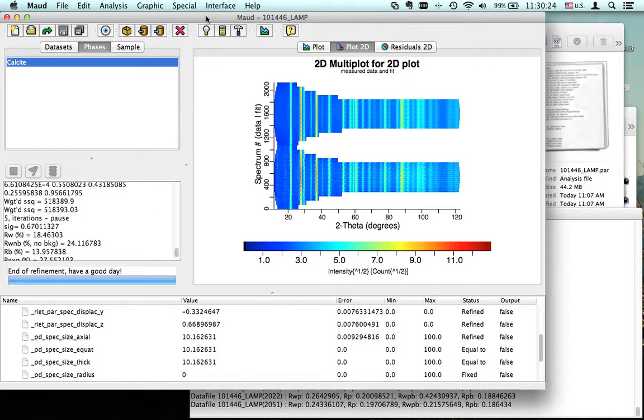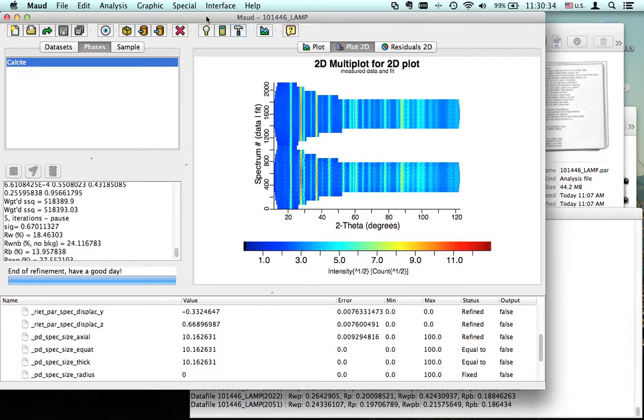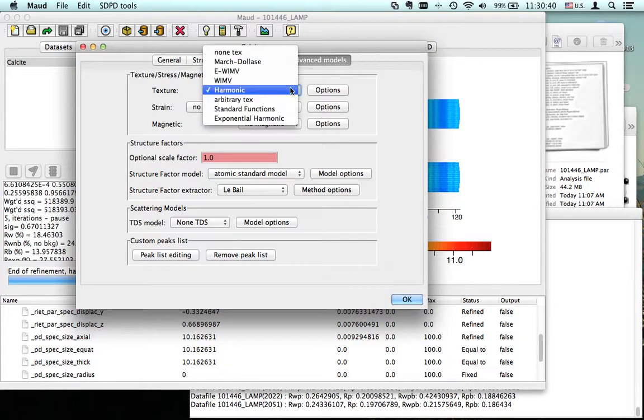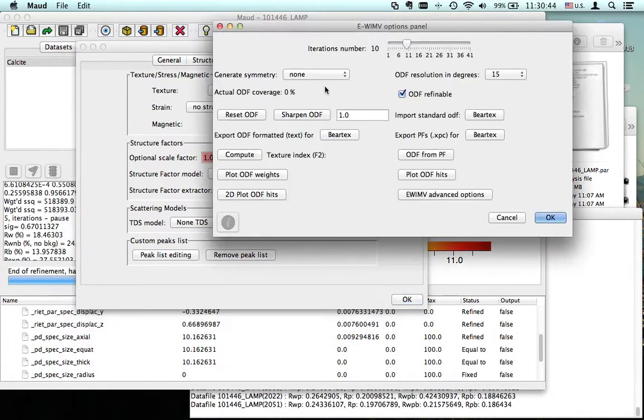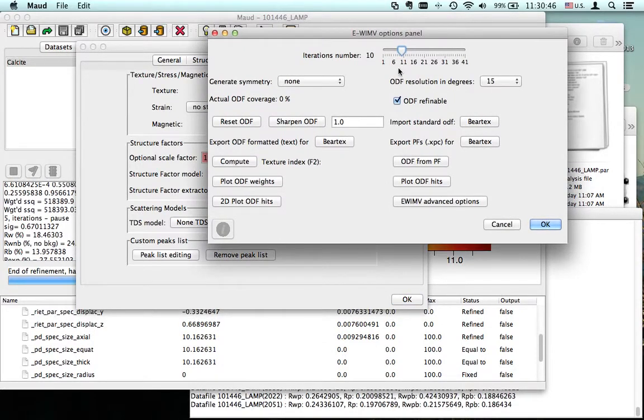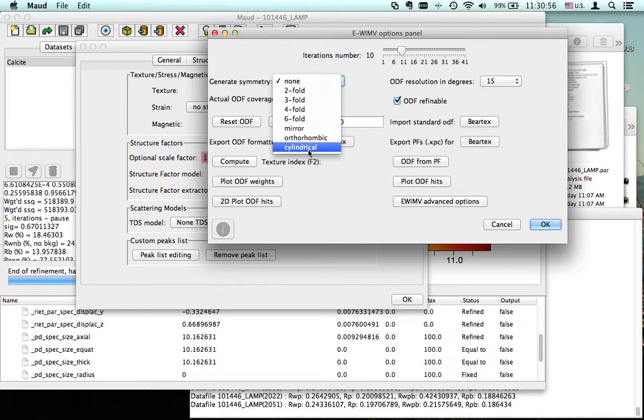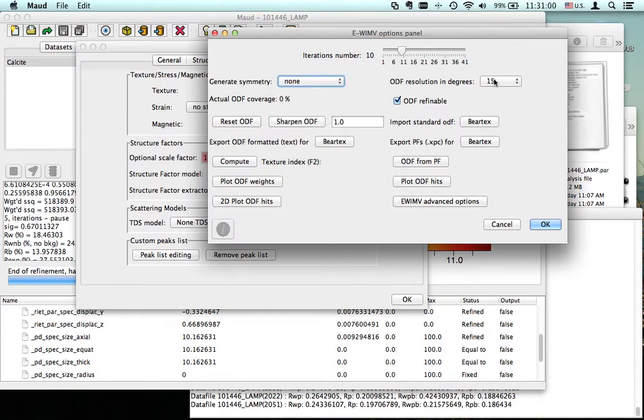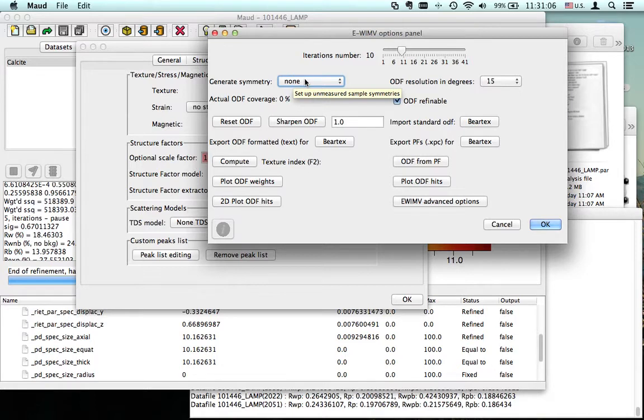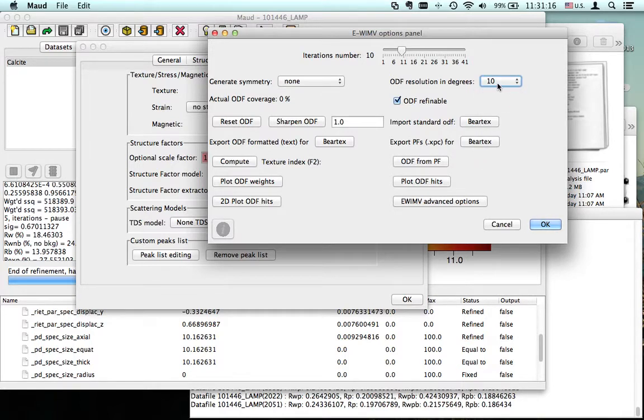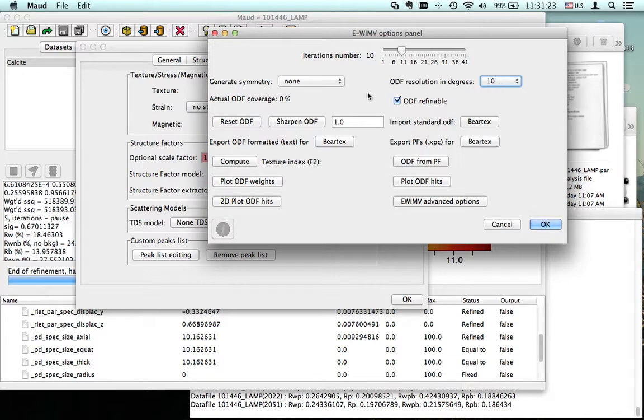Now let's see how we can do a texture analysis using EWIMV instead. We only need to change here in the sample—we change the texture model to EWIMV. EWIMV has different options. Symmetry, like for the harmonics—here we do no symmetry, so triclinic sample symmetry, or you can go up to fiber or cylindrical. We suppose we don't have any symmetry in our texture. ODF 15, the default, is safe but quite large, so we should go with 10.